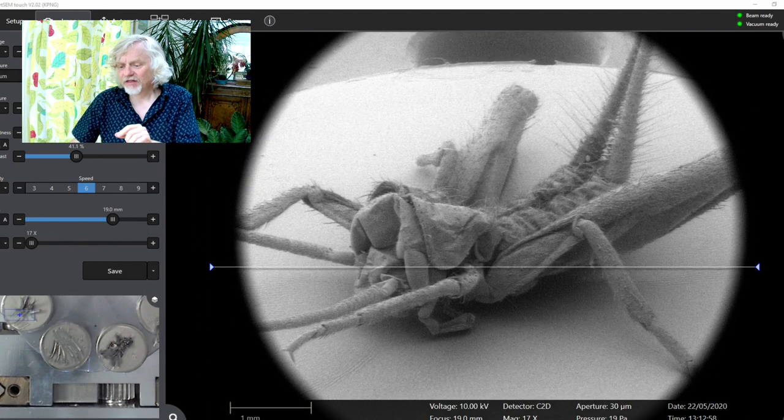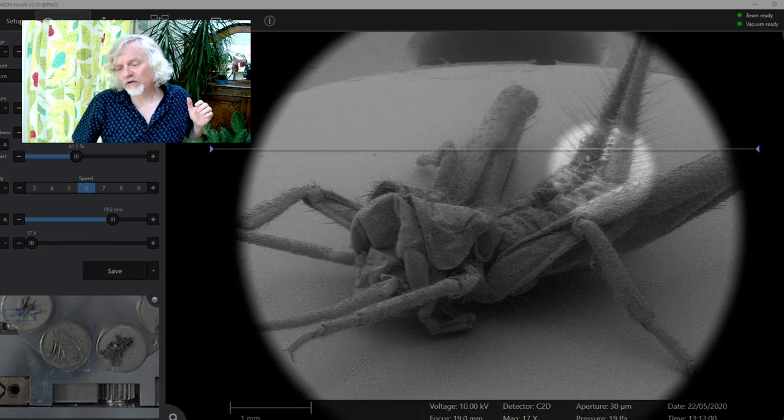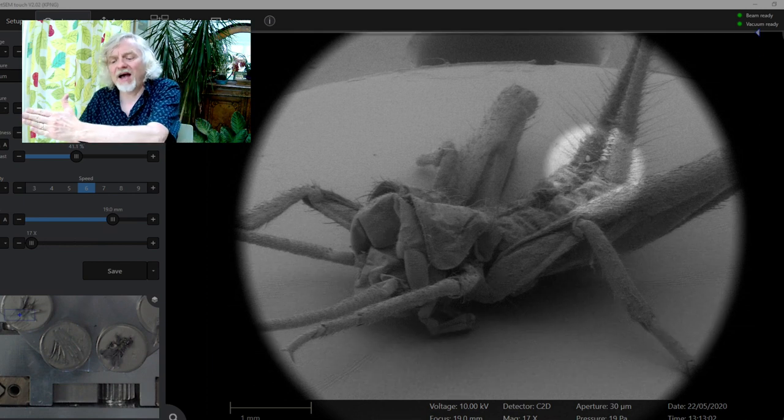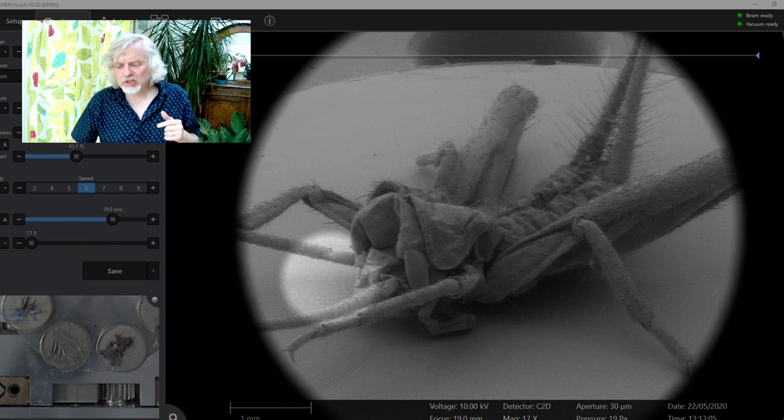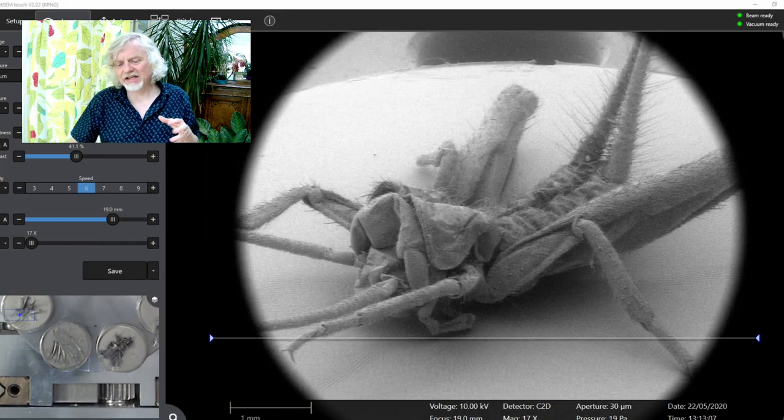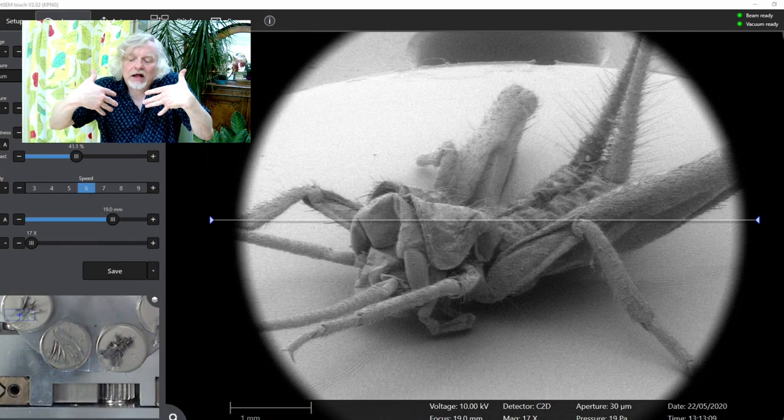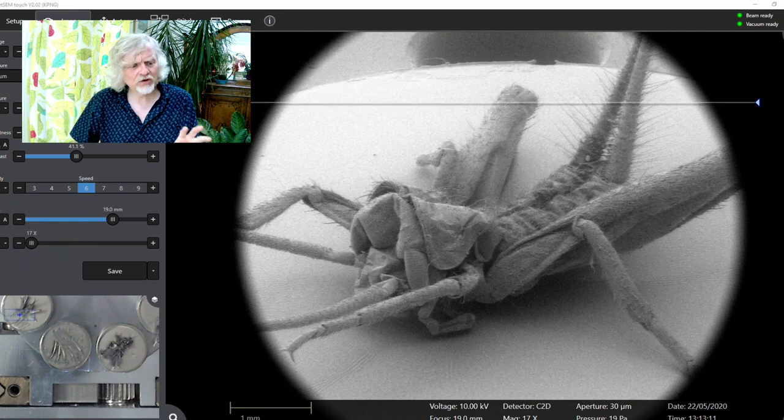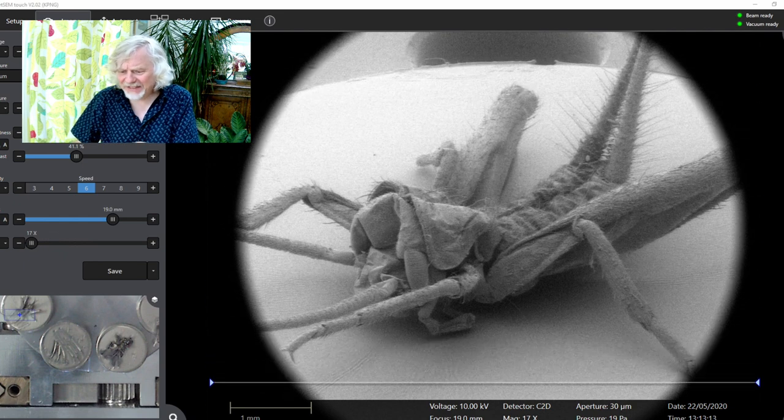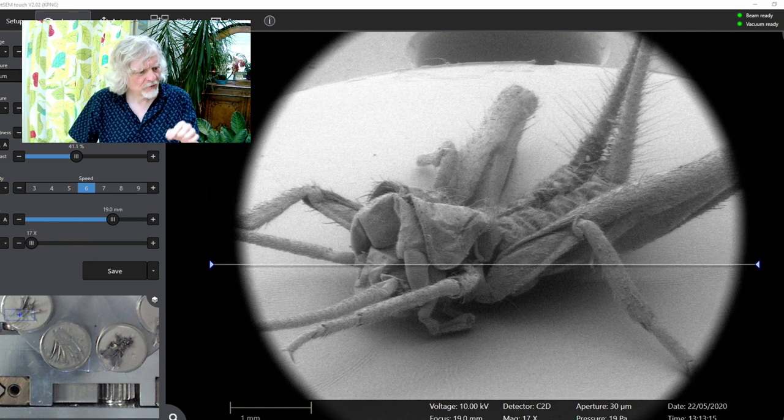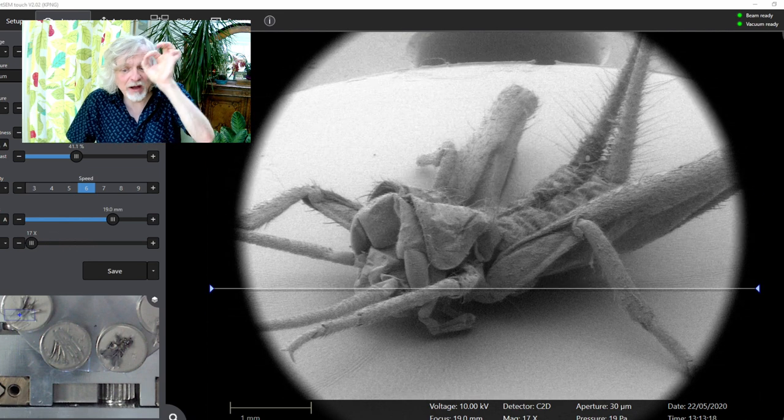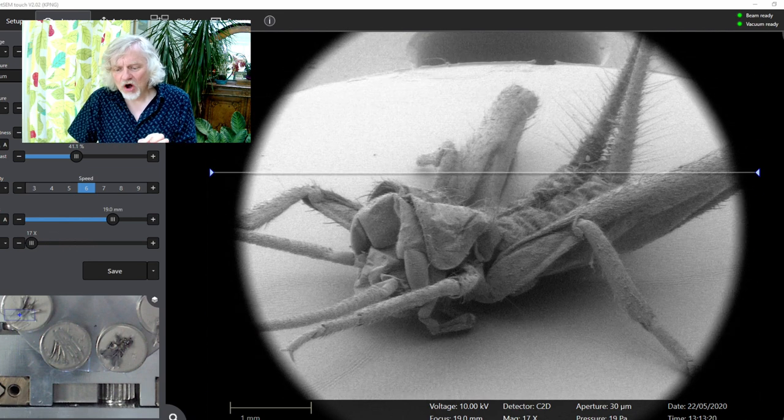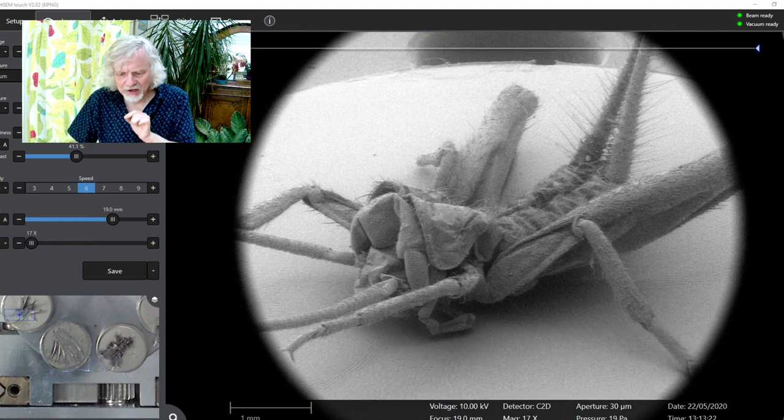I can tell that because the females have a long ovipositor at the back here sticking out, and that's not present. So this must be a male. There's its head and it's sort of collapsed in on itself. And you can begin to see all the hairy detail on this wonderful creature. But what I wanted to do is zoom in on one part of it, and I'm going to zoom in on its antenna here.